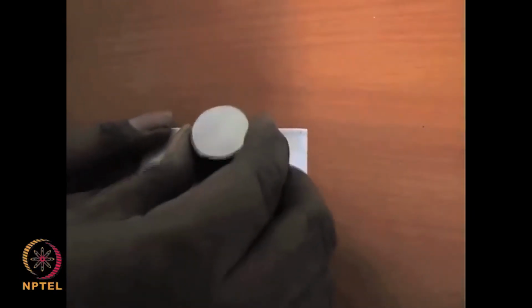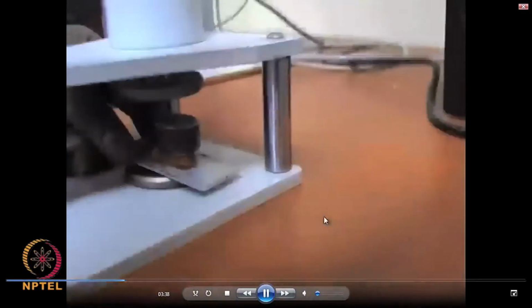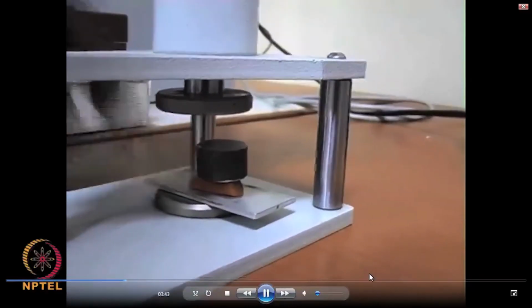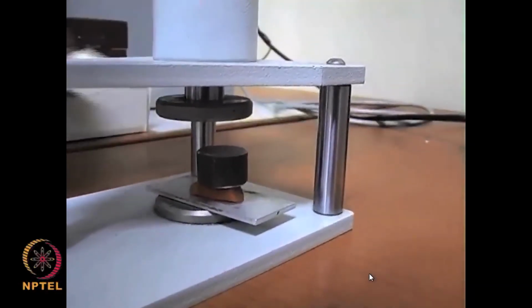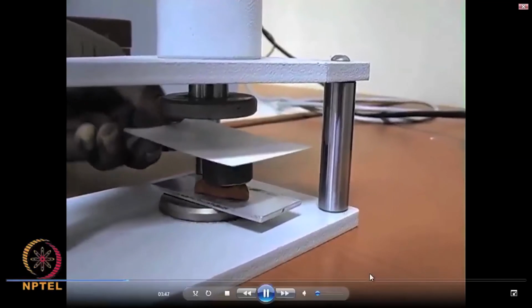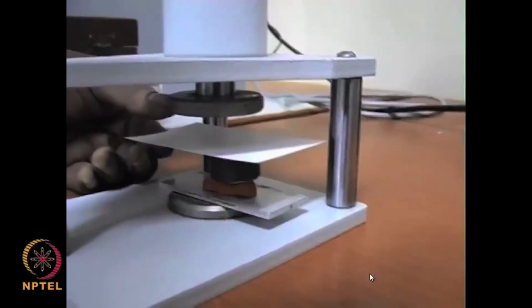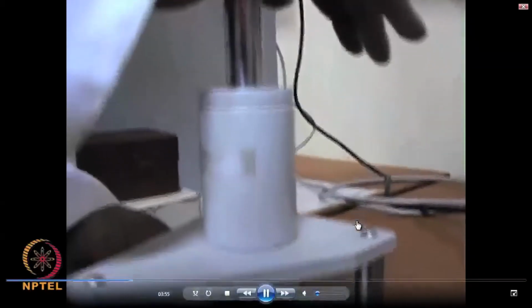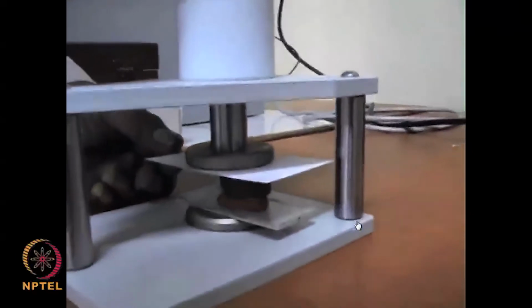We will see how other materials are viewed in other types of optical microscopes. This is how the solid metal piece is leveled using this leveling press, and then it will be placed on the microscope, as you can see.